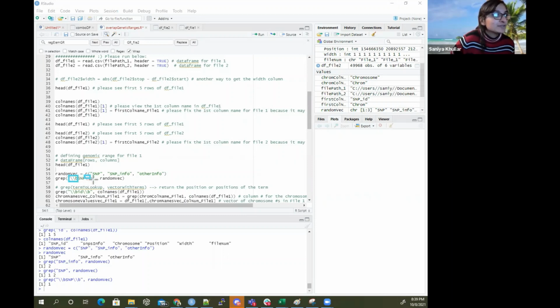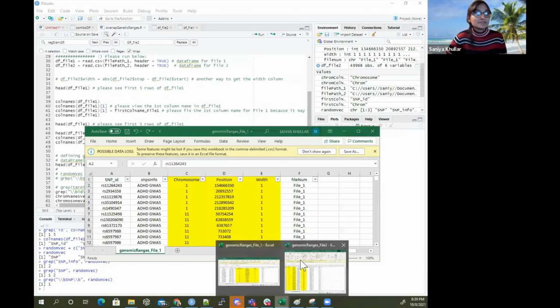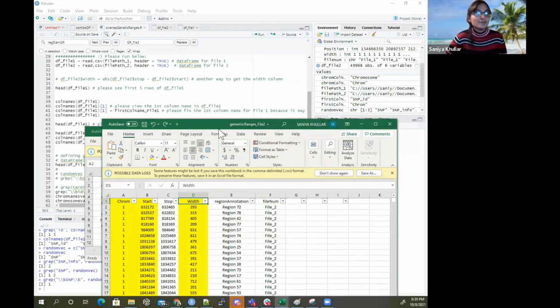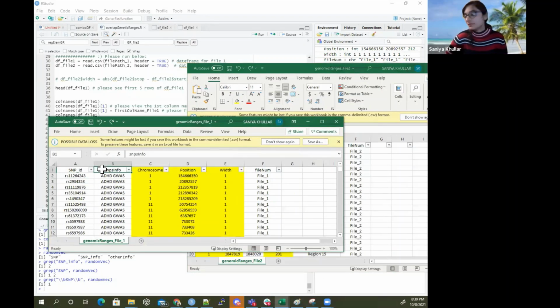For us, it's trying to look for column names. That's why I want to do this, because this may or may not be the first or last time you will ever need to do this. You may have to overlap not just these 2 files, but other files. So maybe in one file, you don't remember what you called it. You called it position here.